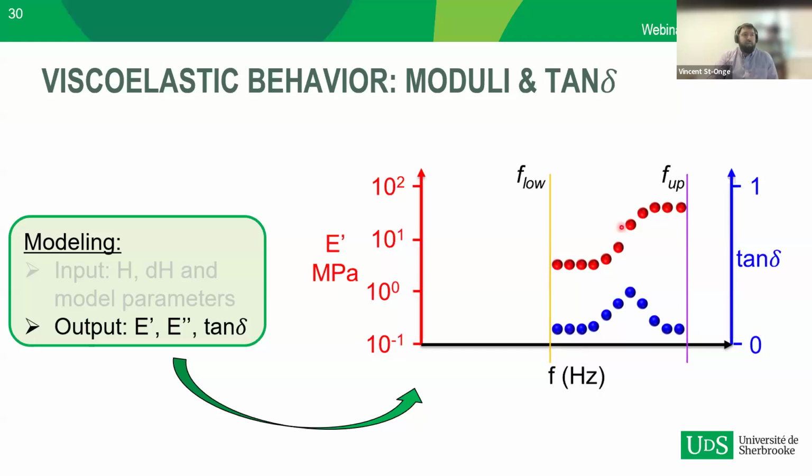The curve that I've drawn is something that would be typical if we were seeing the equivalent of a glass transition happening. But in your rubbers, at high frequencies, you very likely don't want to see that, and you would actually expect to see just a straight line over the range of frequencies when you're testing. And when you have that, you know the viscoelastic behavior of your material.